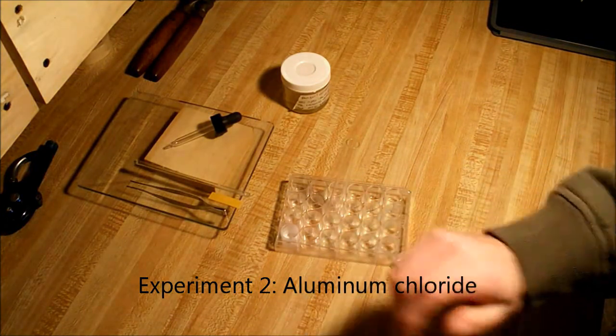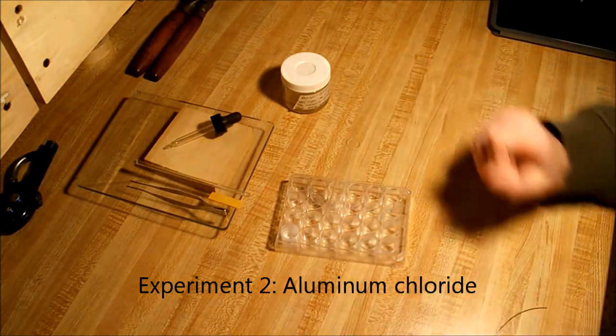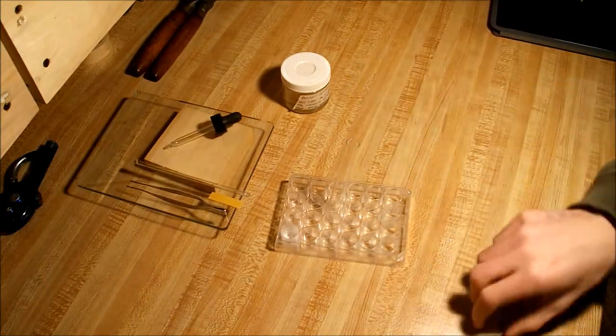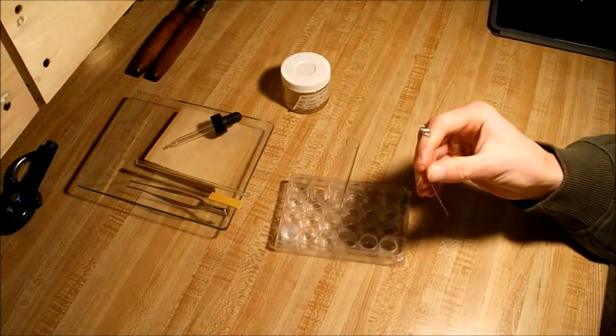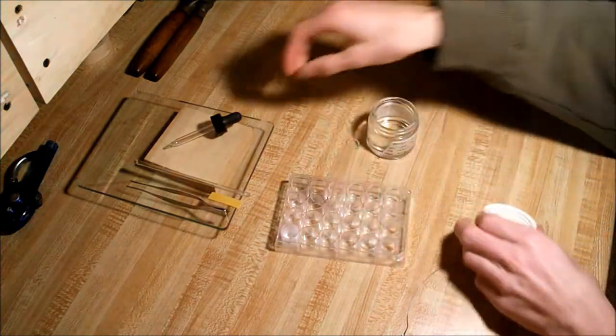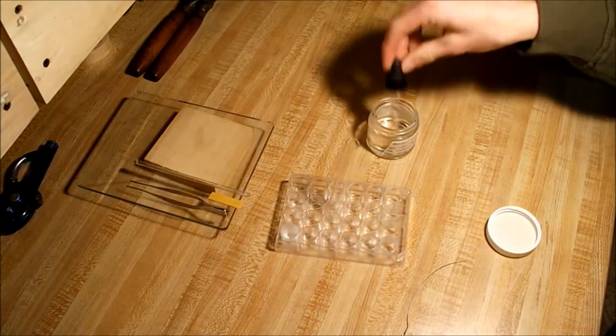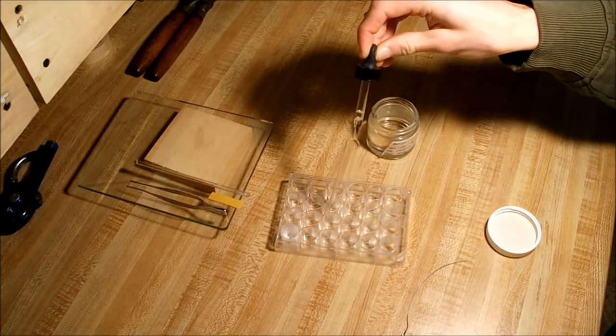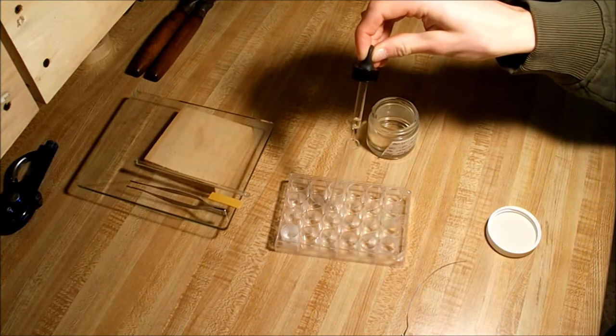Alright, as we're waiting for our iron chloride to finish forming, our next experiment is going to be making aluminum chloride using aluminum welding wire. Same as the last one, I always put 10 drops of hydrochloric acid into the test tube.